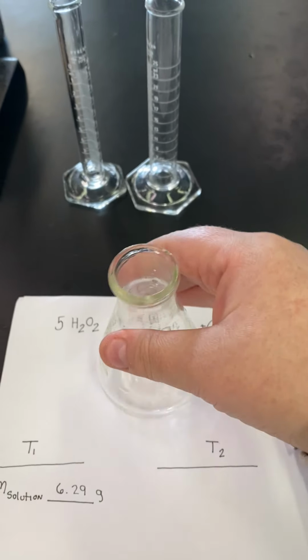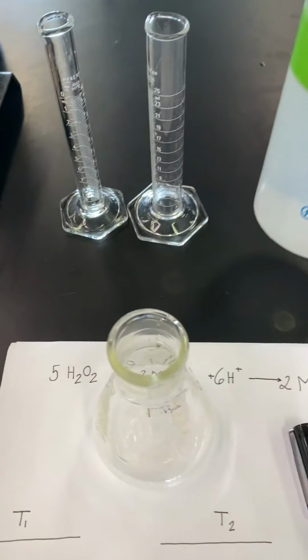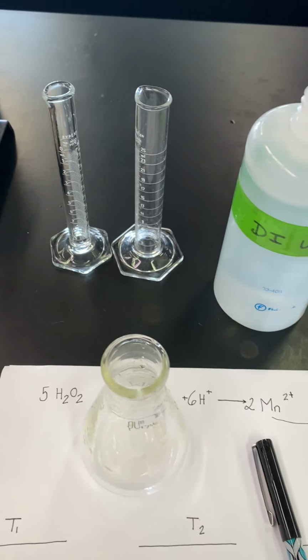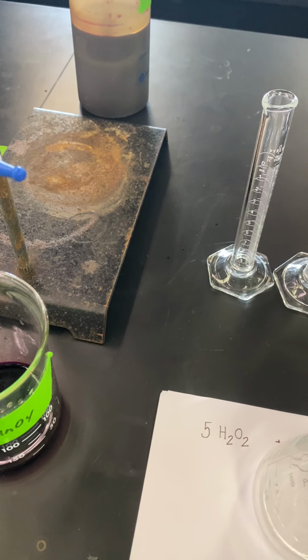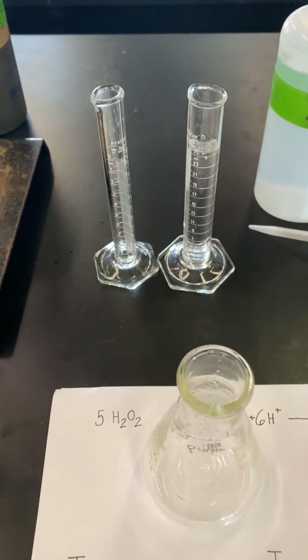Okay, to this flask, I'm going to add roughly 25 milliliters of my deionized water. This part does not need to be exact. The deionized water has nothing to do with the chemical reaction.